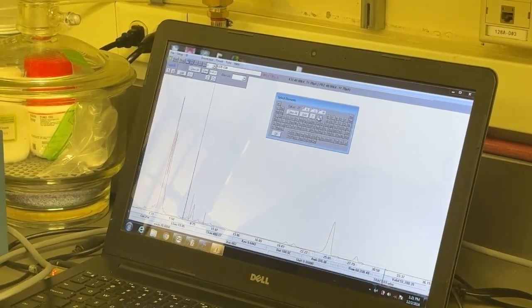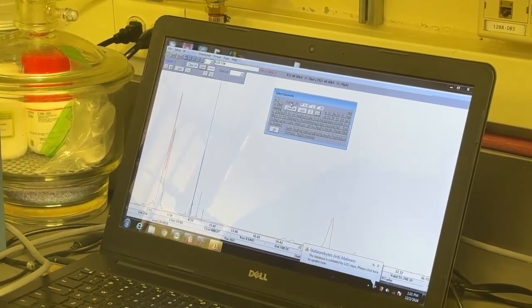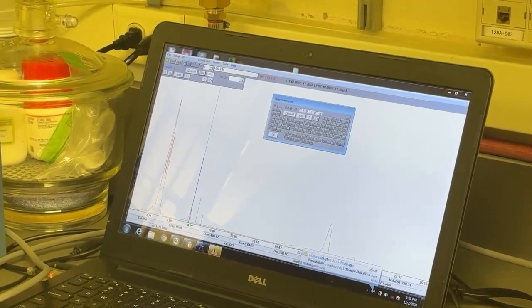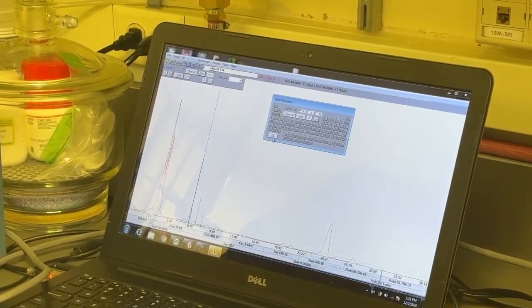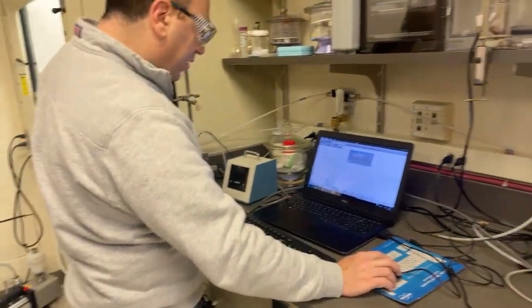So this peak looks like copper. Yeah, it says copper K alpha, which is copper X-rays emitted as secondary X-rays. So then we can add this. These two peaks are copper.